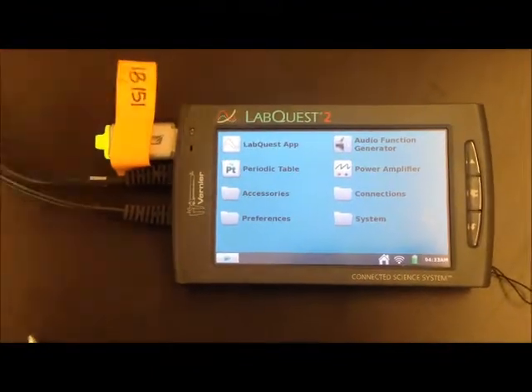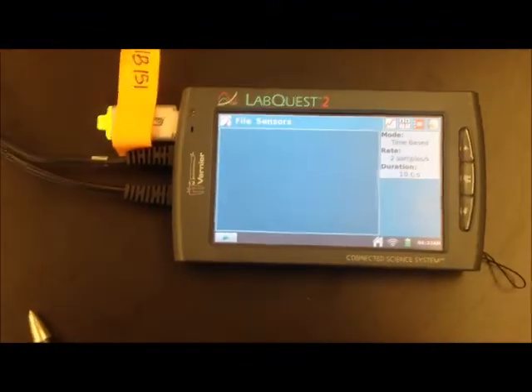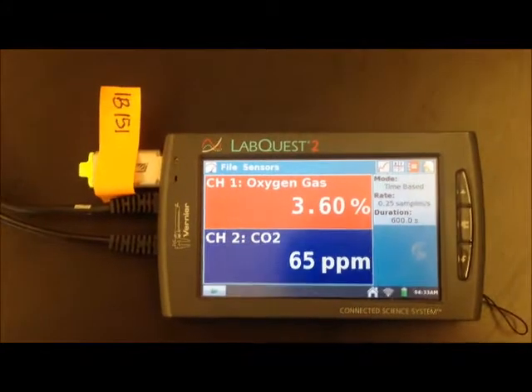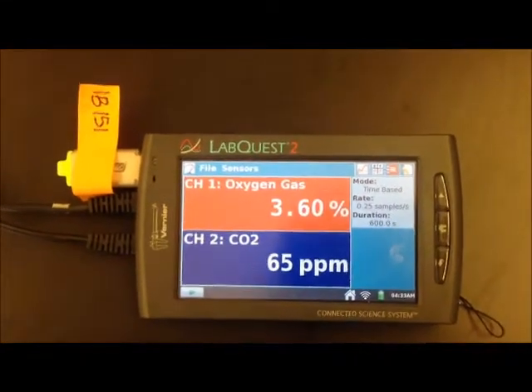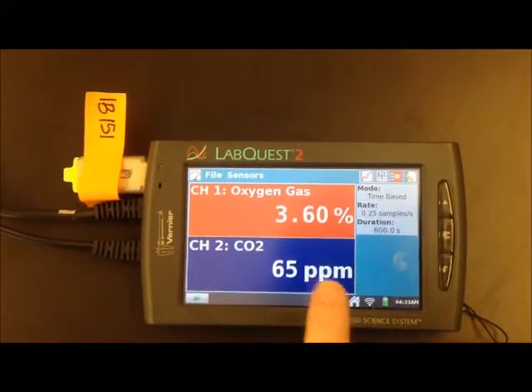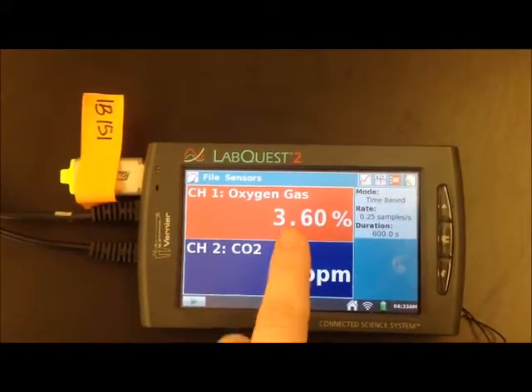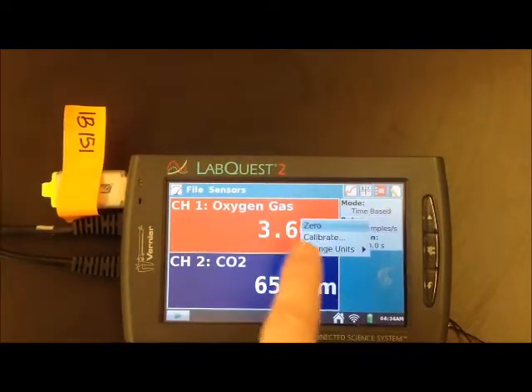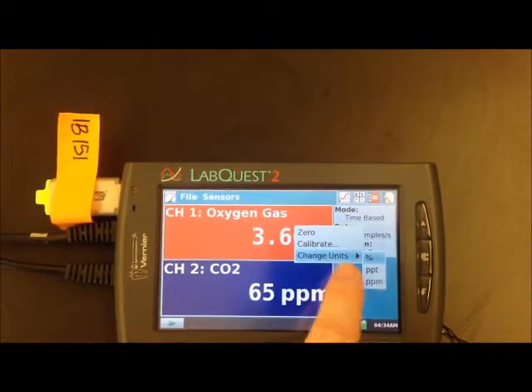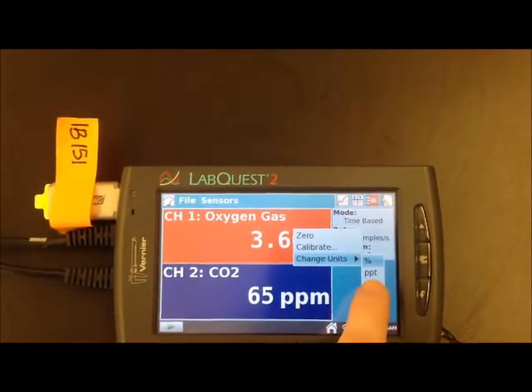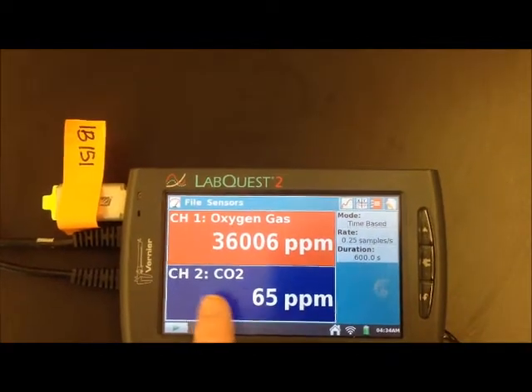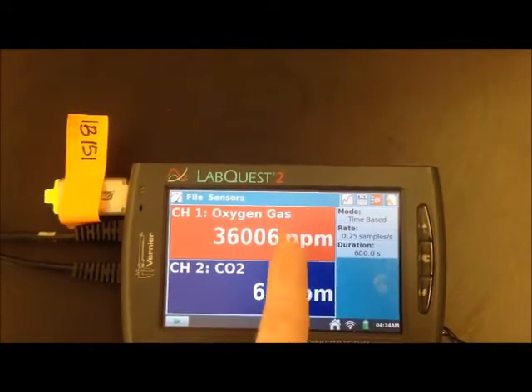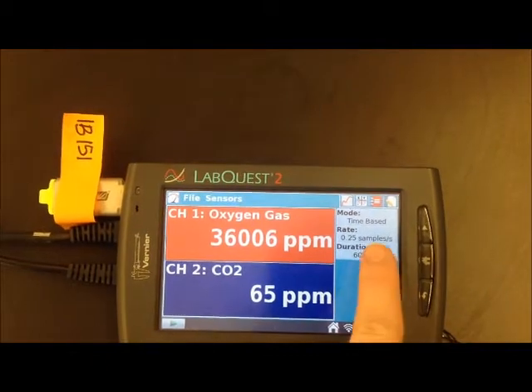We have USB sticks already in so you do not need to provide your own. When the device turns on, it automatically displays oxygen gas in percentages. Click on that, then click 'Change Units' and go to parts per million. We want the CO2 also on parts per million, and that's already set — so that's good.